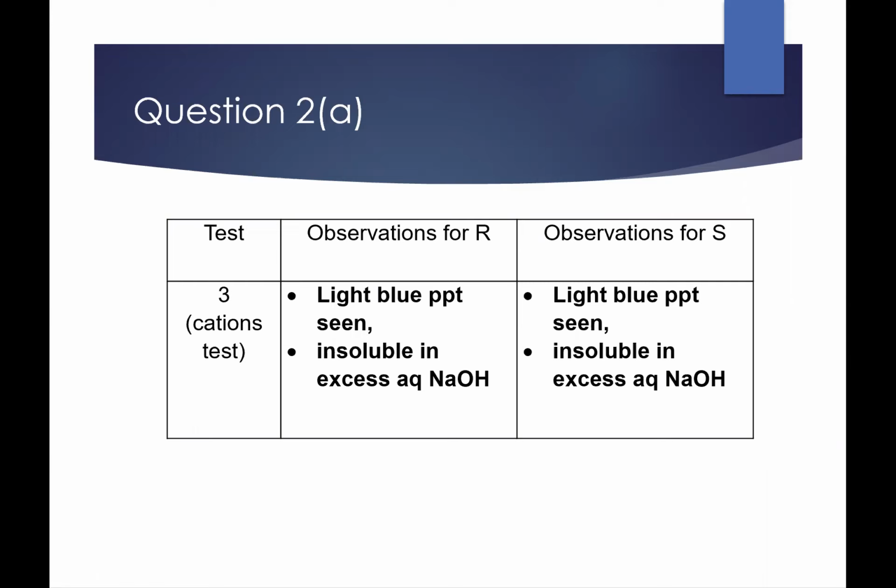Now, test 3 with your aqueous sodium hydroxide is yet another cations test. So in this case, your light blue precipitate is soluble, okay? It is insoluble.